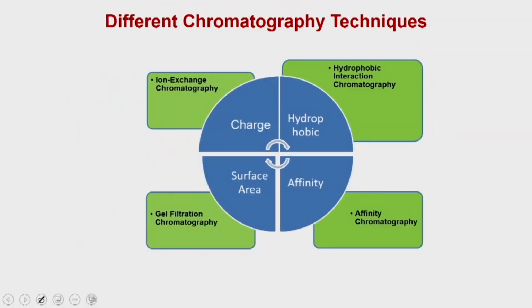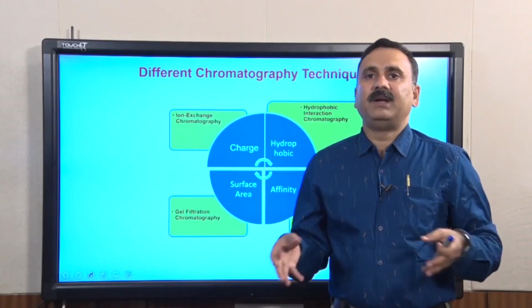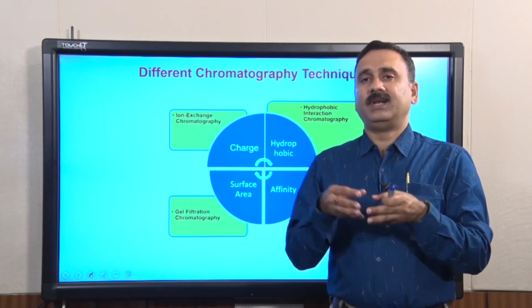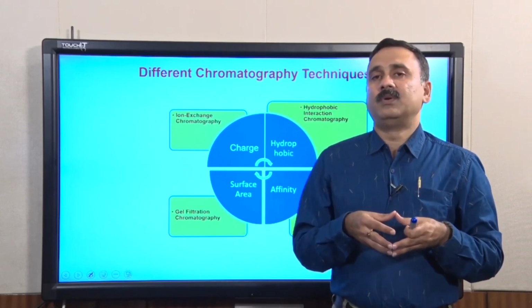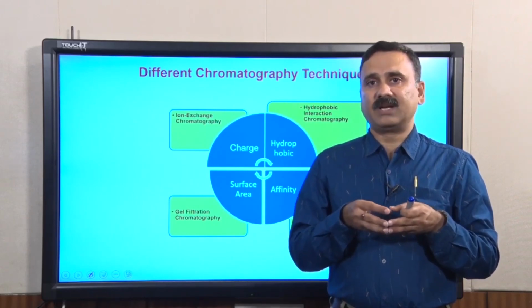So, this is all about the different chromatography techniques which you can use to purify factors from the cells overexpressing your protein or other metabolites. Now, let us recap and summarize, and also understand how you can exploit these different chromatography techniques to perform protein purification or purification of your factors.